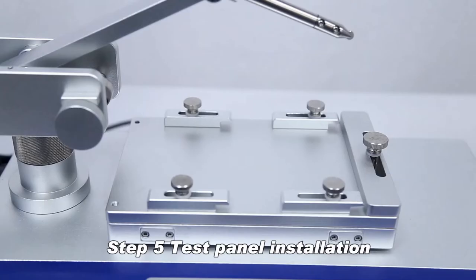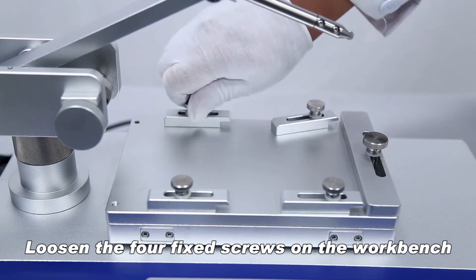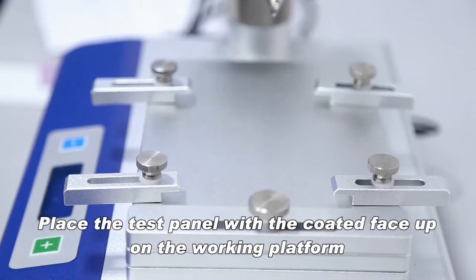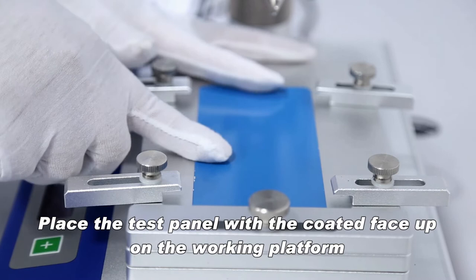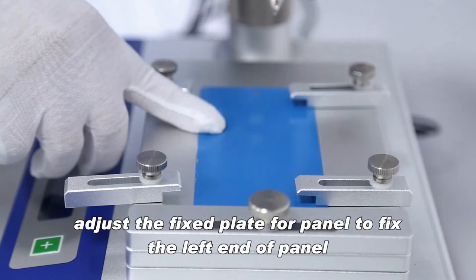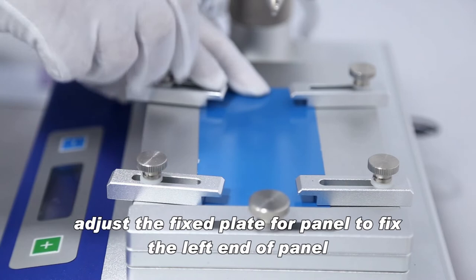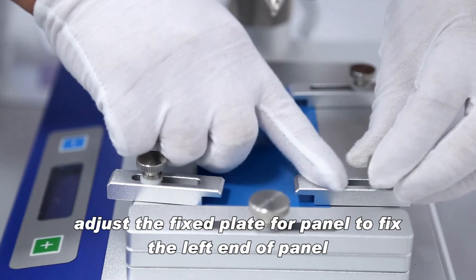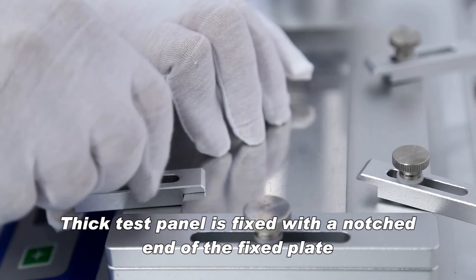Test panel installation: Loosen the four fixed screws on the workbench. Place the test panel with the coated face up on the working platform. The right end of the test panel is pressed against the right edge of the workbench. Adjust the fixed plate for panel to fix the left end of panel. Thick test panel is fixed with a notched end of the fixed plate.